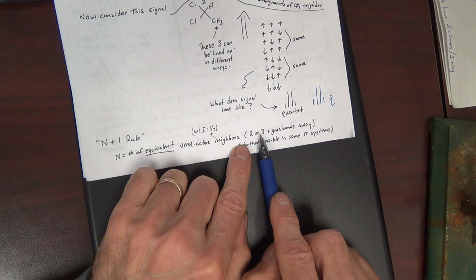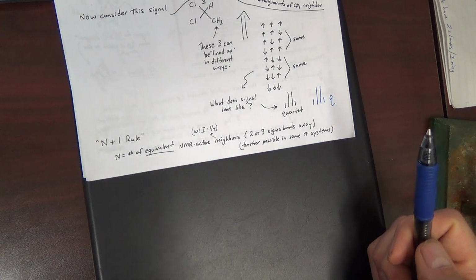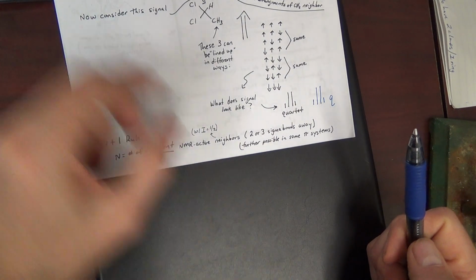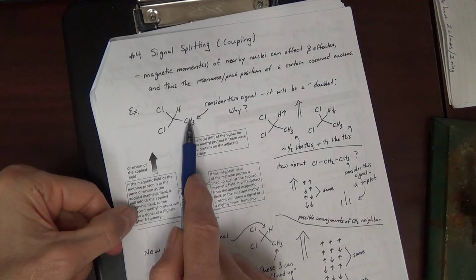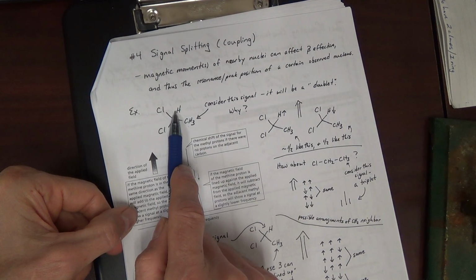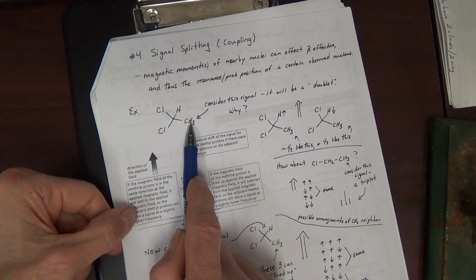It's limited to 2 or 3 sigma bonds away that the so-called coupling will take place. We say that this signal is coupled to this H, and that's why this signal is a doublet.